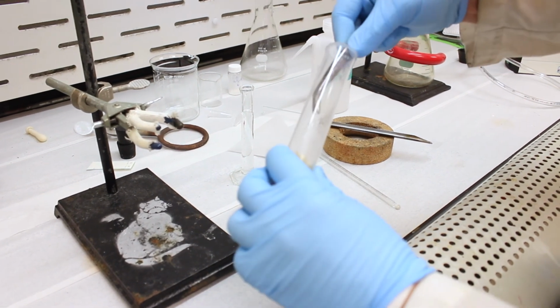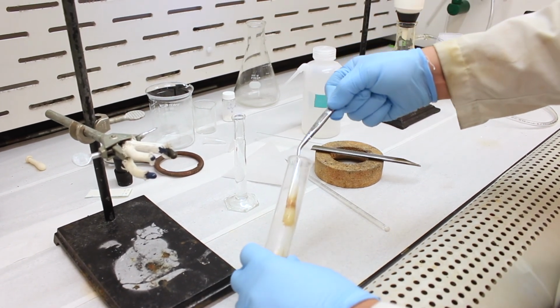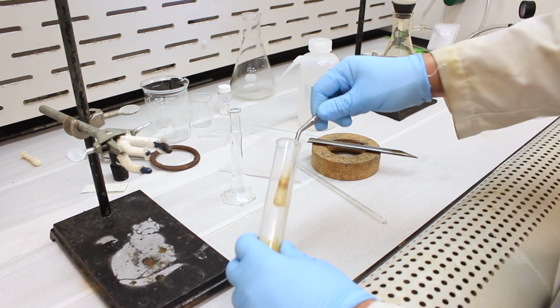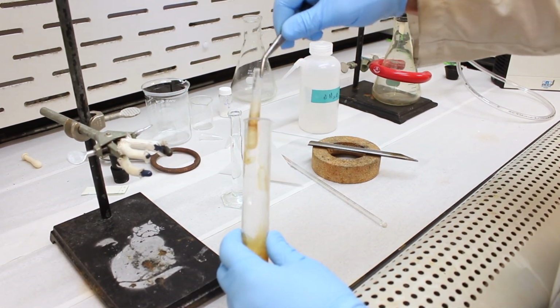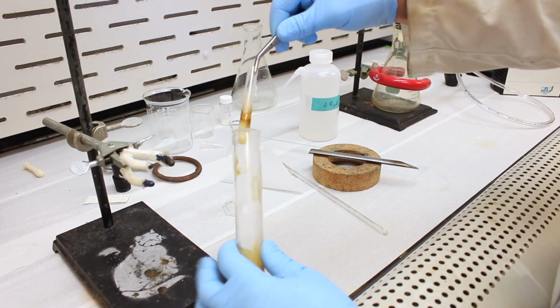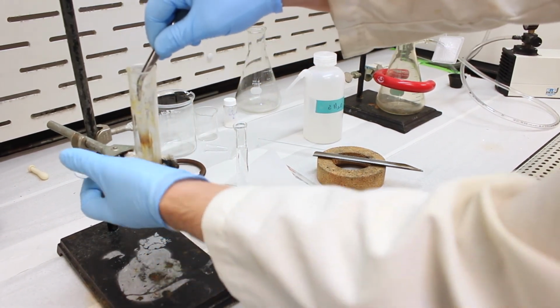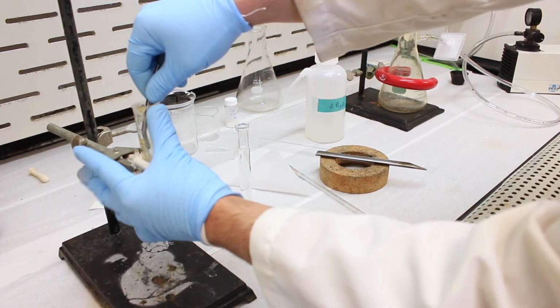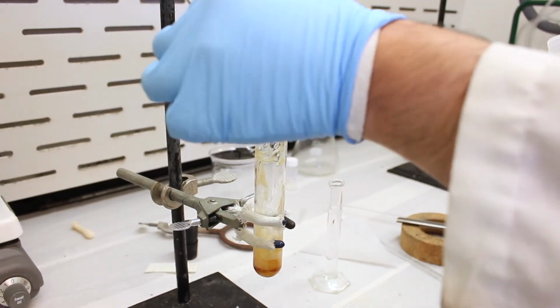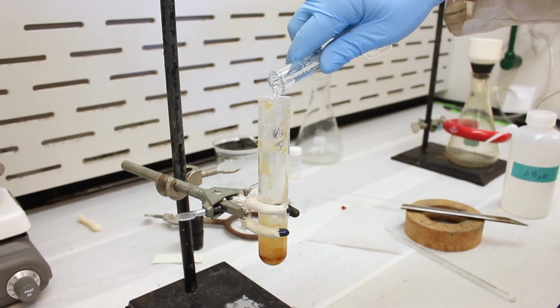All right, so we've got a pair of tweezers, and we're just going to carefully extract this. Okay, if you'll notice here, it looks like there's some sticky residue. So we're going to try to wash this. We're going to add some water to this flask to precipitate the product, but we'll also try to wash the inner tube here. So I got some water. Okay. Then we'll add 10 milliliters of water.